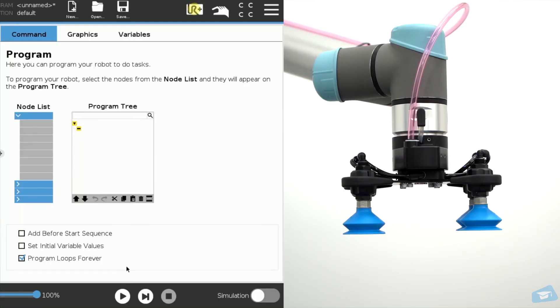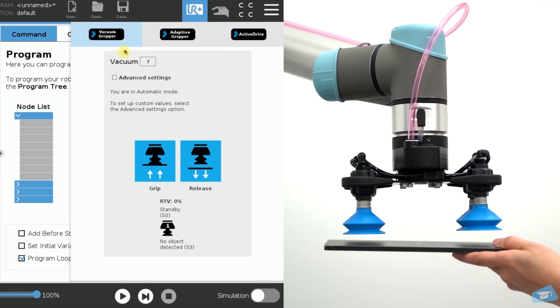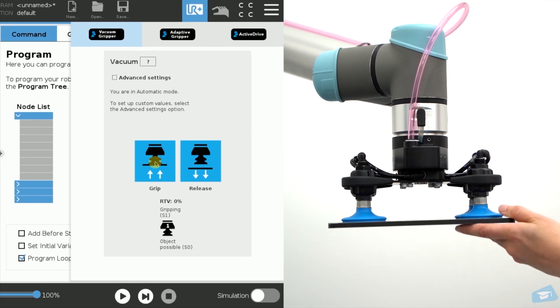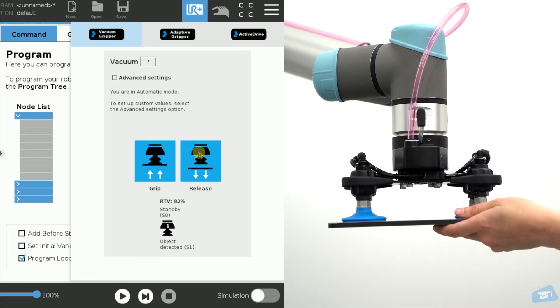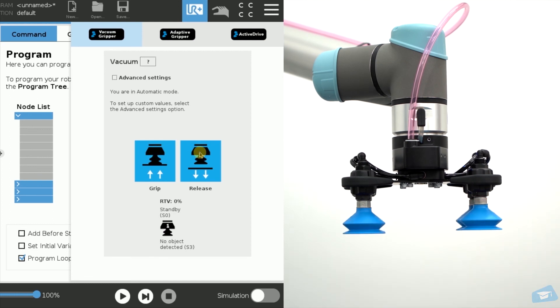Validate your installation by clicking the UR Plus menu. Place a part under the suction cup and click the GRIP button. The part should be firmly held by the gripper. Tap the release button to let go of the part.